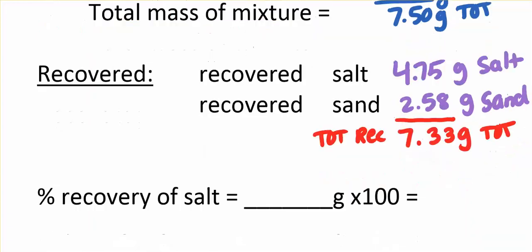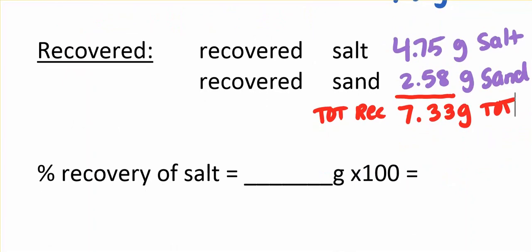Okay, let's do some calculations. What percent of the salt did we recover? Well, how much did we recover? We recovered 4.75 grams.